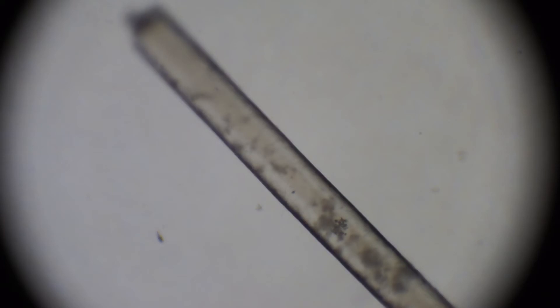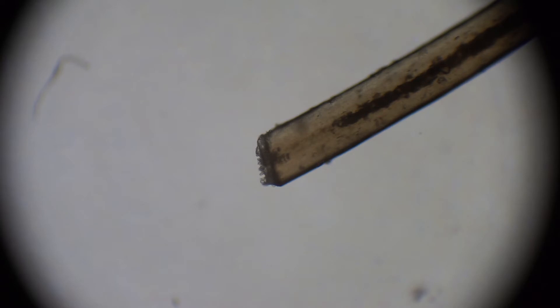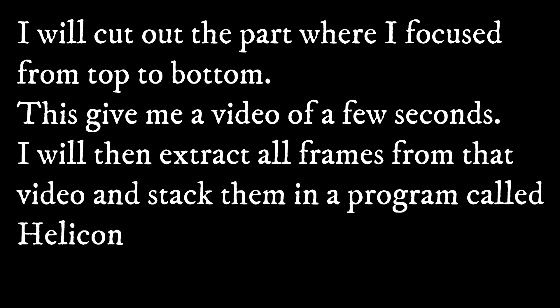Here we change to the 10 times ocular and we see pretty much detail directly. Here is the light brown one. And we change to the 40 times ocular. As you can see here the depth of field is very short. So when we zoom in something so much or have a closer look like this, it's impossible to get the whole object sharp.